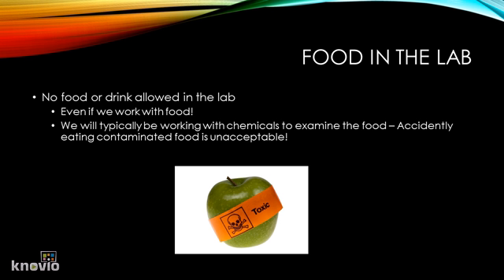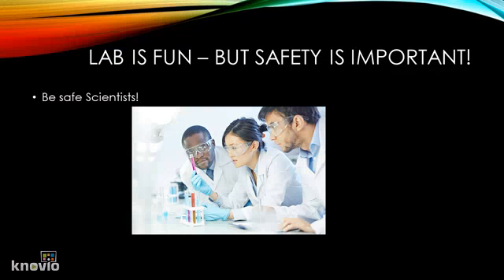So if we work with food, that's something that should be brought up in our lab safety protocol beforehand and should be stressed that we are not eating this food that's in the lab. It's only for testing purposes, and all of it should be considered contaminated. Accidentally eating food is just unacceptable. Students should understand the risk associated with such an activity.